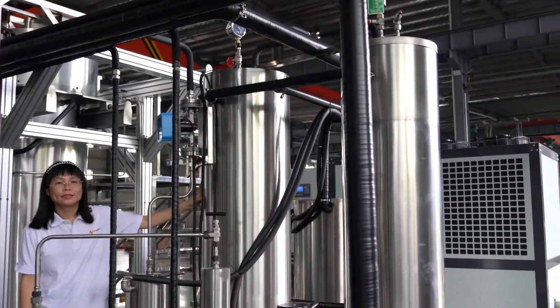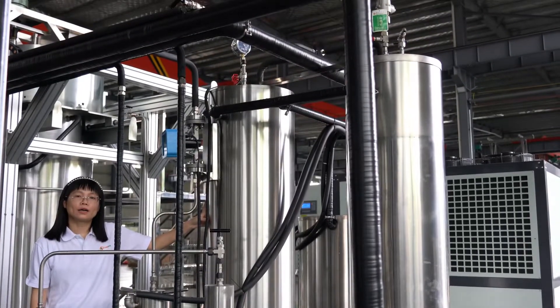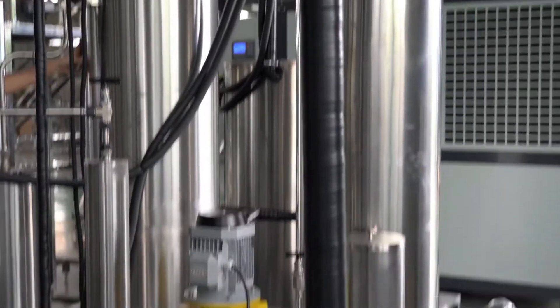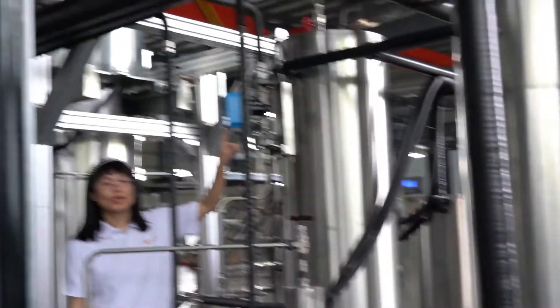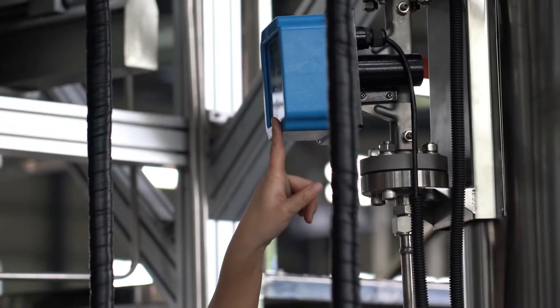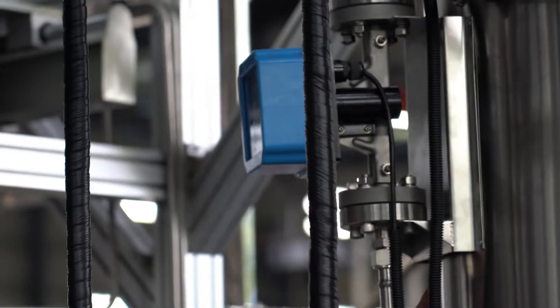Here are the two carbon dioxide storage tanks. The blue gauge is a carbon dioxide flow meter gauge. It shows the flow rate of carbon dioxide.